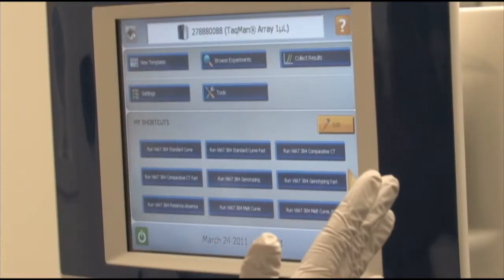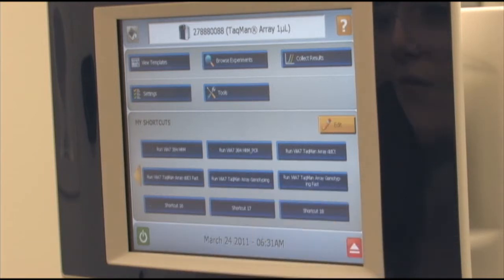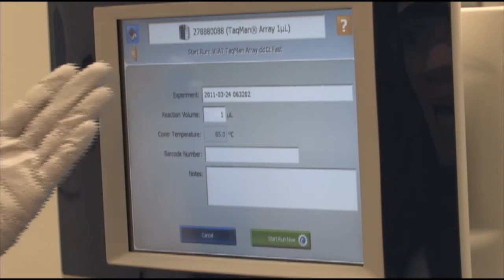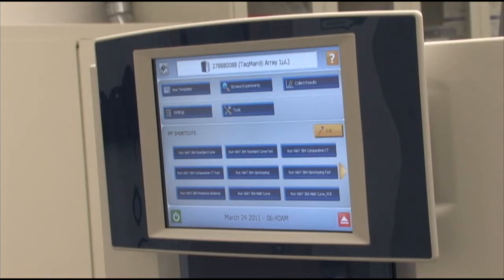On my touch screen, I'm showing that we have the TaqMan Array 1-microliter block. I'd like to run the appropriate protocol, so in my shortcut menu down here I have the Va7 TaqMan Array Delta Delta CT protocol. I'm going to choose that protocol. Then we have an experiment name, reaction volume, barcode number if I would like to use that, and notes if I would like. I'm going to press start the run now.